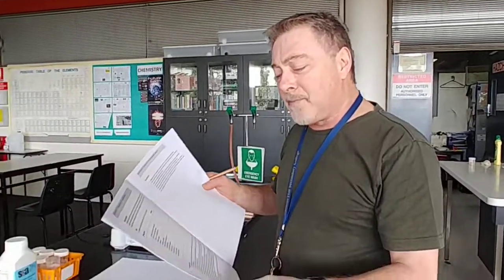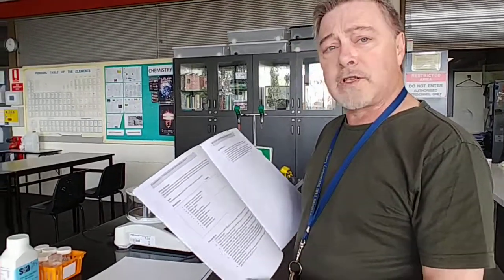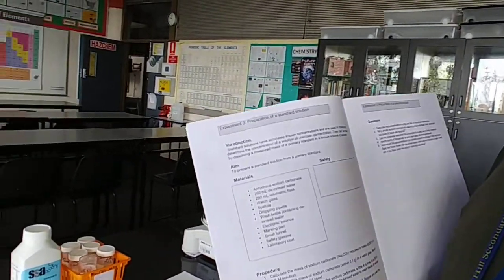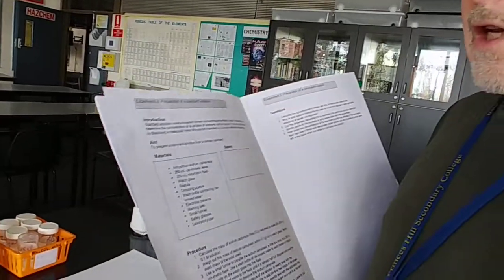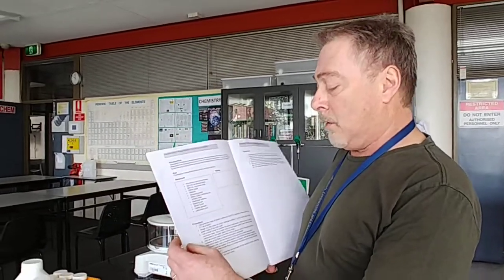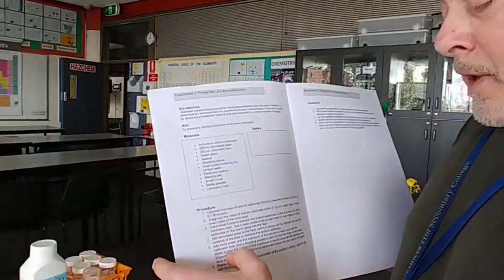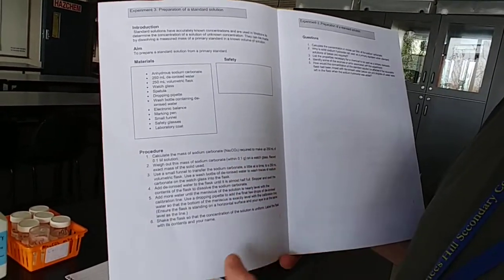Good morning. Once again, welcome here to the Princess Hill 3 out of 6 lab. What we're going to do today with the Year 12 students is what's called a preparation of a standard solution. We're going to run a demo. Normally you will be doing this yourself, but we're going to go through the whole process, and in particular today we're going to make a standard solution of sodium carbonate. It's going to be roughly a 0.1 molar solution. And typically you would use this in a titration.